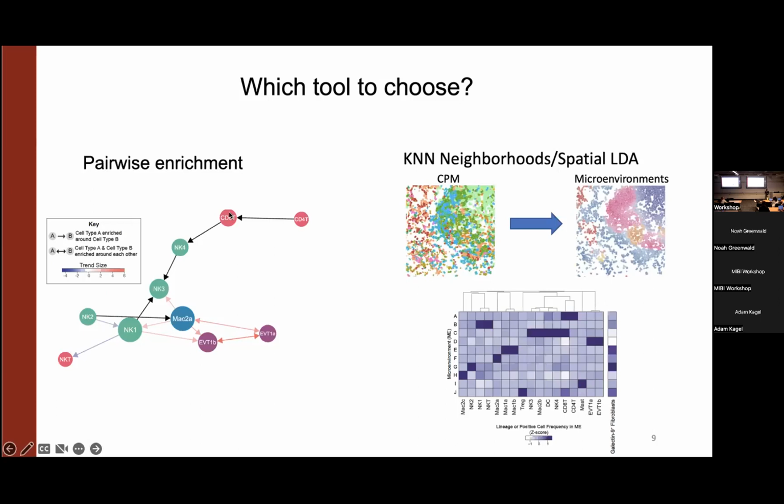And finally, I would like to give an example of how you can use the output of these microenvironment algorithms and plug it into subsequent analysis to get some more insight about what is happening in your tissue. What you can see here, in the rows, are microenvironments numbered from A to J, and the columns are different cell types. The color indicates the composition of each of the microenvironments in terms of cell types. And over here on the right side, you can see this tiny heat map that describes the expression of an interesting functional marker, in this case galectin-9, in fibroblast cells.